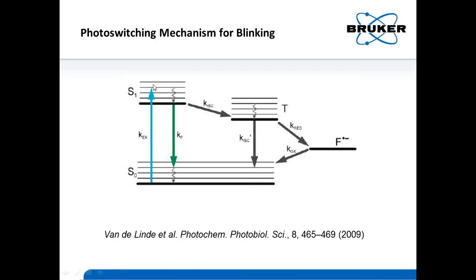So depending on the intensity of the lasers that you're using, proportionally you can also do something called intersystem crossing and then transfer molecules over to kind of like an unstable triplet state here. And the molecules that are in the triplet state are very, very susceptible to oxygen that's present in the system, and they can destabilize the molecule and essentially photobleach it.